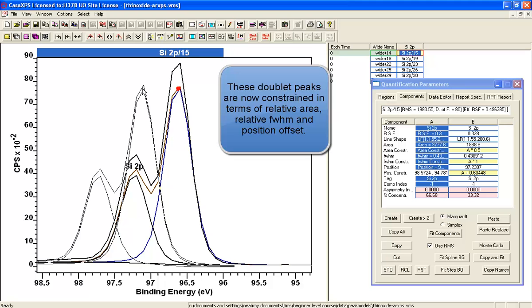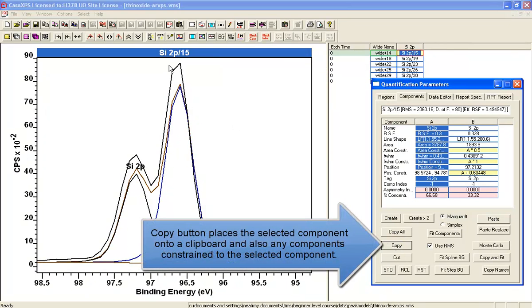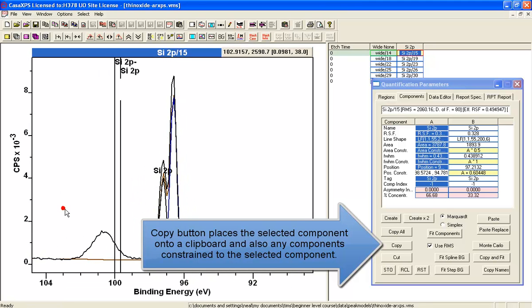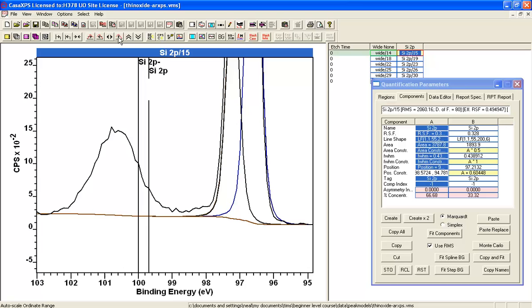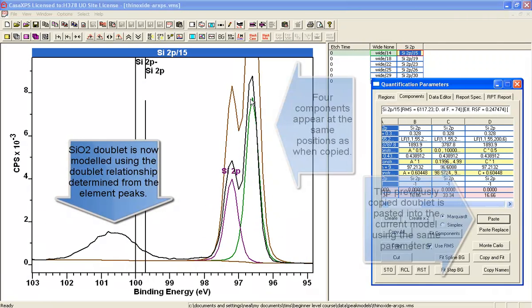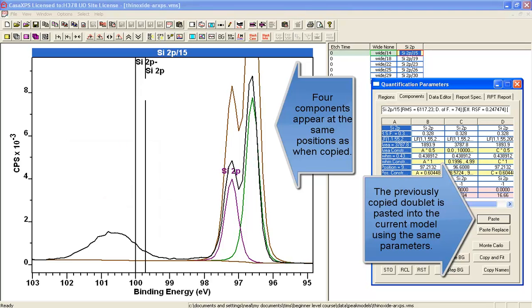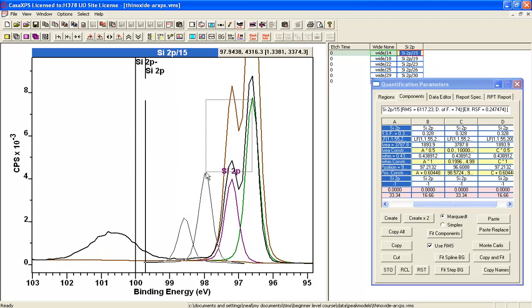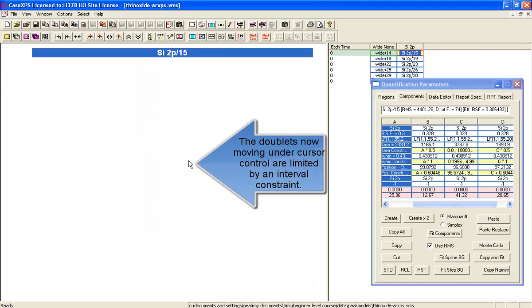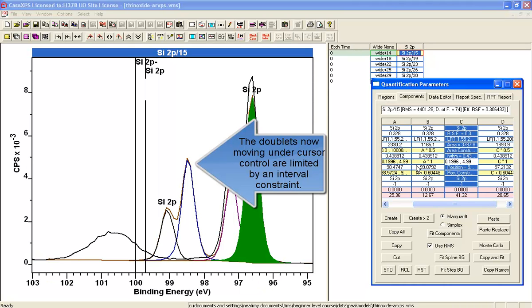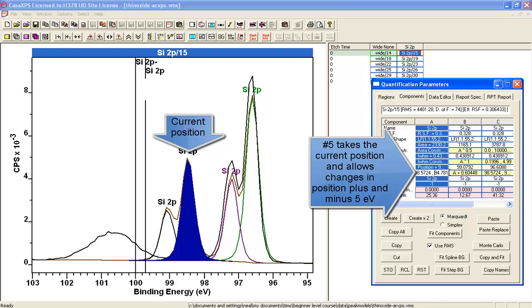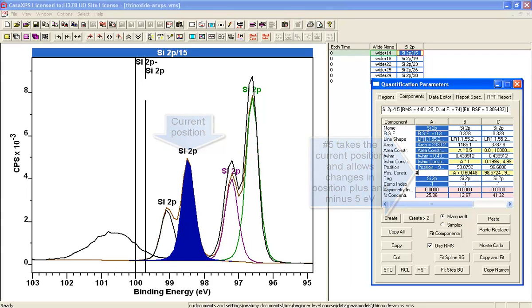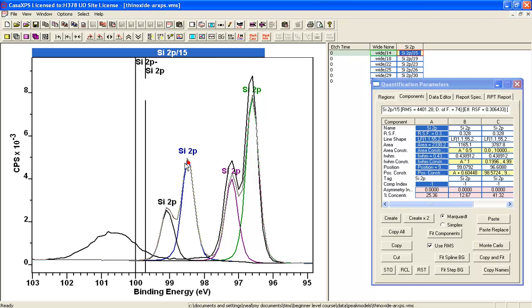So if I copy these peaks, I can use them when I want to work on the oxide peak here, which should also be a doublet. So if I say paste, I get another pair of peaks here. They overlap because they're in the same position, and I can then adjust. Let's see which one I've moved. I've moved this one here, and I need to just relax the constraint in terms of peak position by saying hash 5, and that gives me a bit more leeway to move this peak around and place it with the oxide.